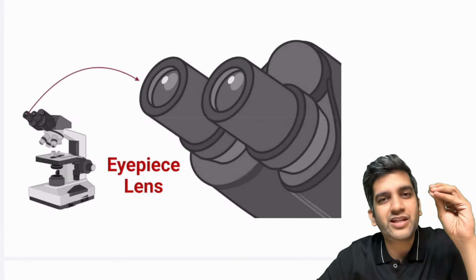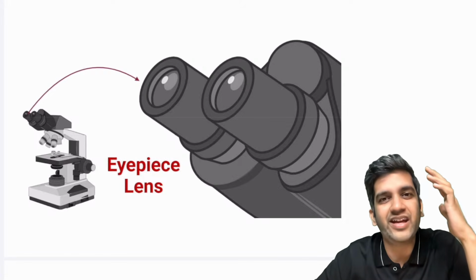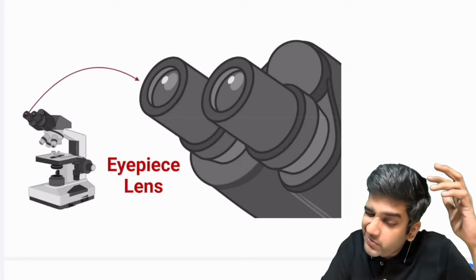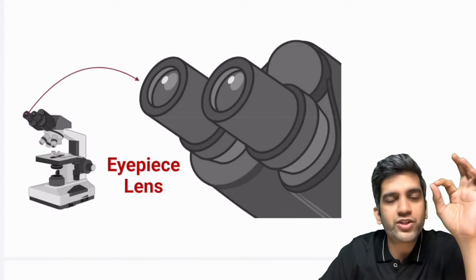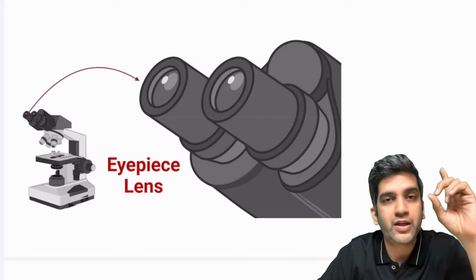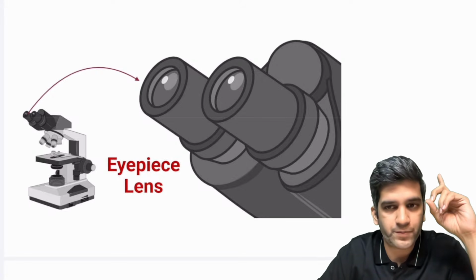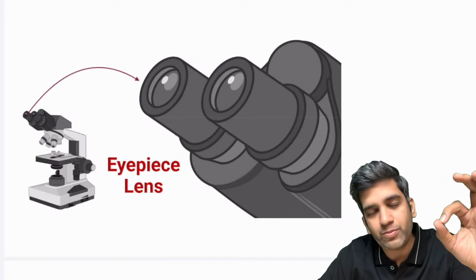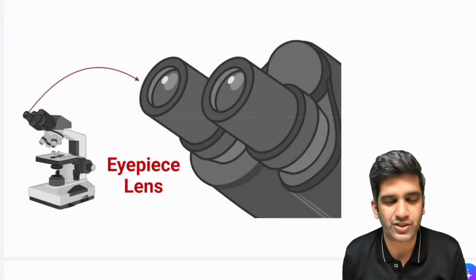That is one of the biggest resistances for pathology, because it will cause headache. If you look like this in any place for 5 minutes, it will cause headache. The goal is, how do I make sure the eyepiece works properly? Next time when you go to the lab, do this. If they have not taught you, do this. You can actually see beautifully through both, right? It's a simple concept of light, what you read in physics, that's all, right?